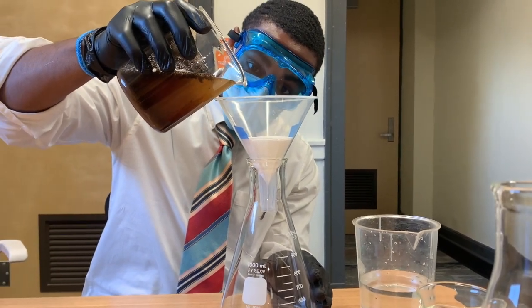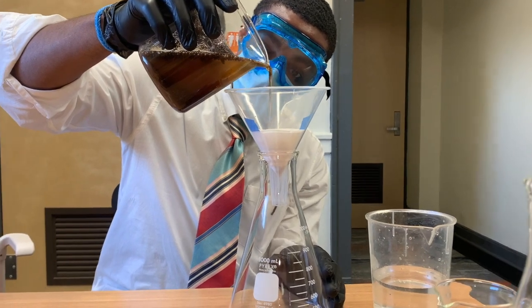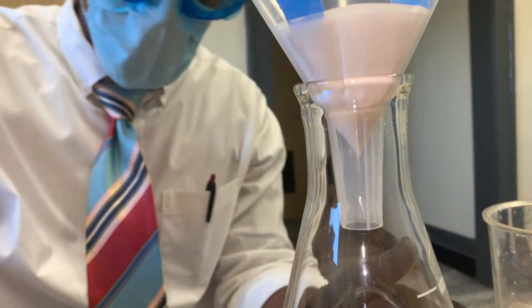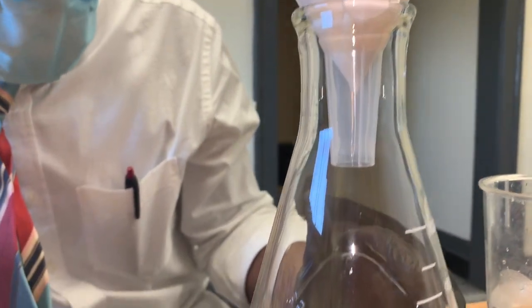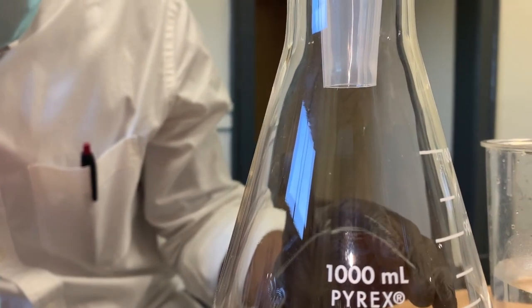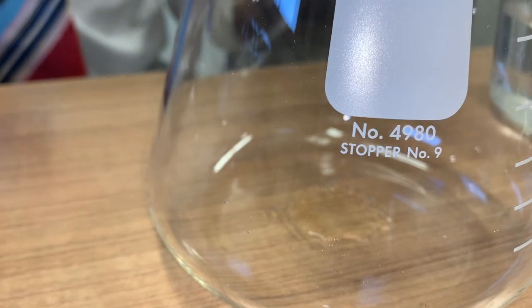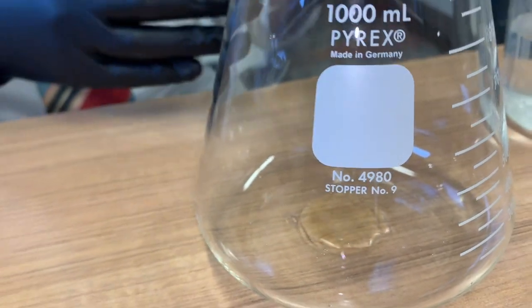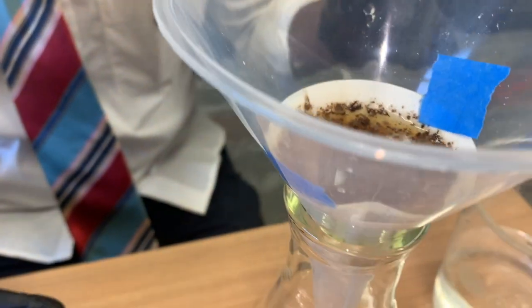Right. Now you want to remember not to put too much in. And there you go. It's a slow process, but through filtration, we can filter out any unwanted substances that are in the water.